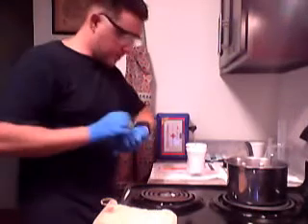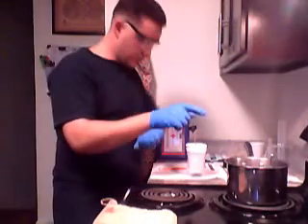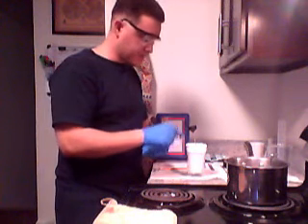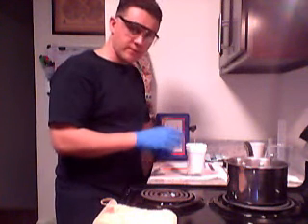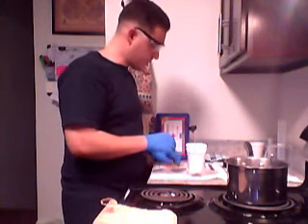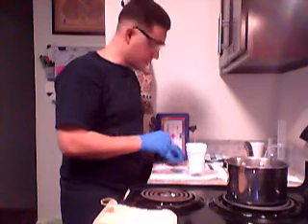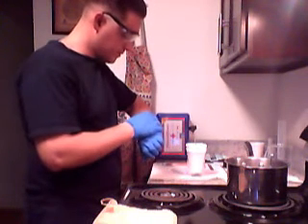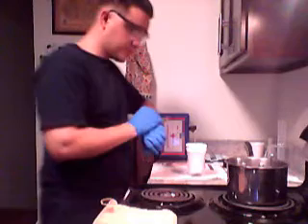Okay, it's coming up on 5 minutes here. I'm about to transfer my unknown metal to my calorimeter, and we're going to measure the temperature every minute for 5 minutes and record it in trial 1 of table 3. Okay, so here we come up. Alright, it's been 5 minutes.